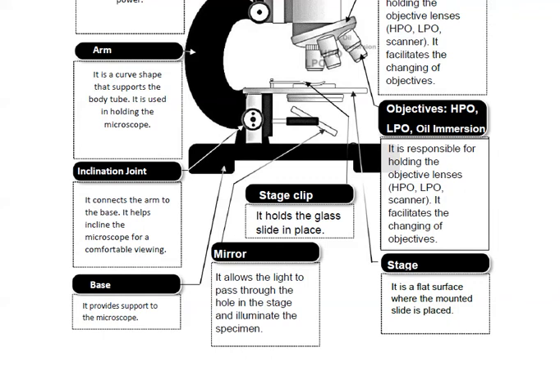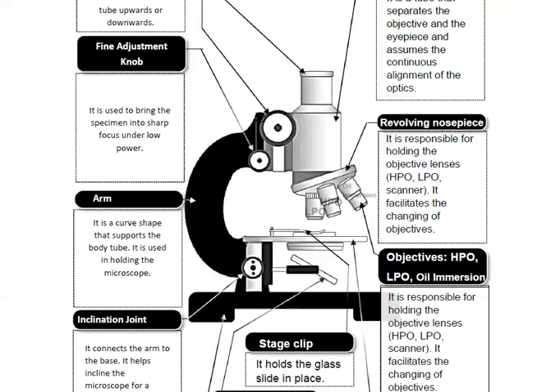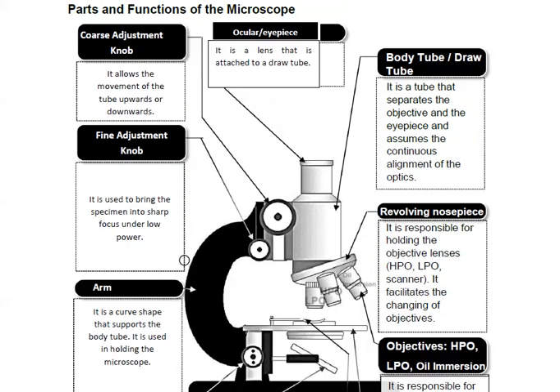And the base, of course, kung aha lugar, provide support para makatindog ang microscope. The mirror is where it will help the light pass through it, then reflect din siya dinha. And the stage is this one. Kung aha na to kay butang ang slide where the specimen is. So, these are the common parts of the compound microscope and their functions.